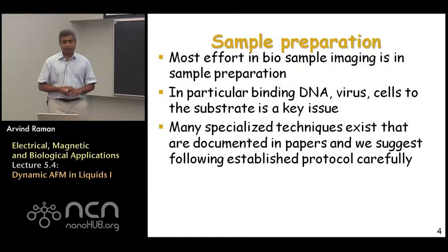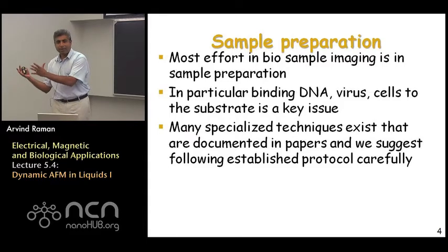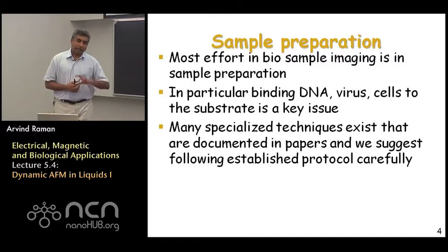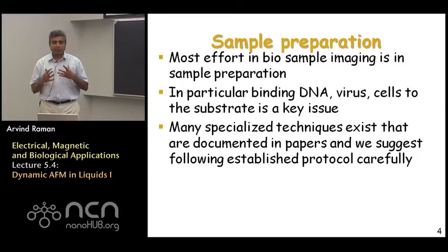Now, before moving ahead with talking about some of the key aspects of what happens when you take an AFM in air and vacuum and put it into liquids, it's worthwhile posting a caveat here, which is that unlike air or vacuum, and in some sense in a very different way from air and vacuum, preparation of samples for liquid environment imaging requires a lot of attention to sample preparation.